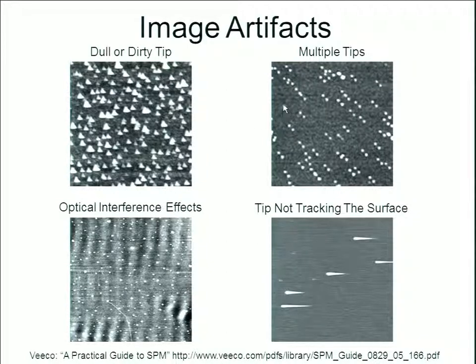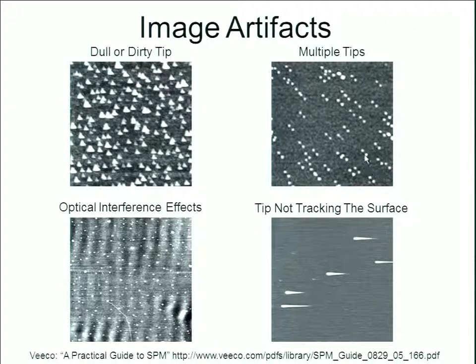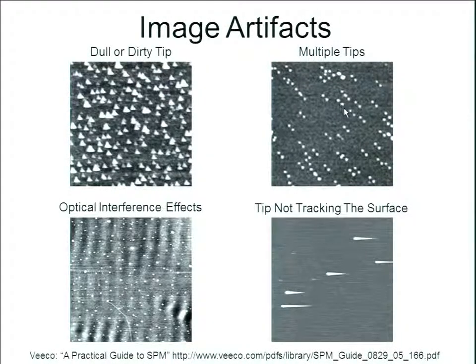Another example: a contaminated or slightly chipped tip can cause tip doubling or even tripling. When scanning across a sample — say, 10 gold nanoparticles on the image — since you have a tip contaminated enough to cause tip doubling, you're going to see twins and a doubling of the true particles that were there. About two-thirds of the particles visible are not actually present on the sample.